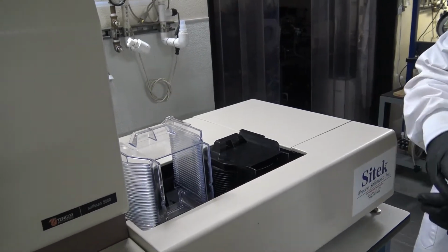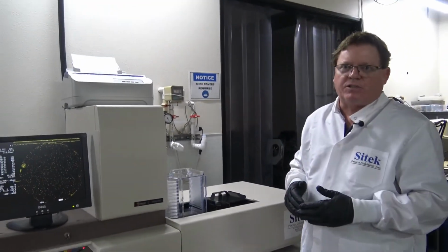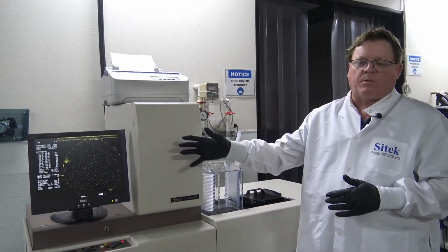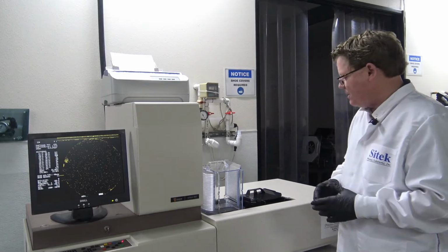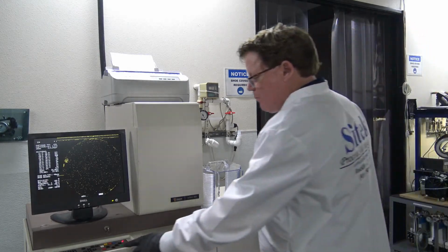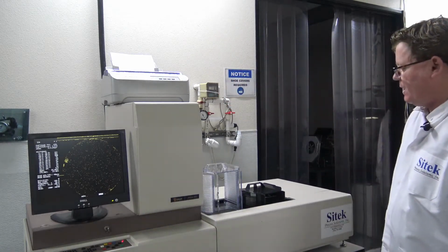As you can see, with the Tencor Surfscan, you can set the parameters of particles and haze, and the system will decide by the parameters you give it if it passed or did not pass. So then that showed that. Now to bring it to home position, you can hit home. That'll bring up the second elevator.